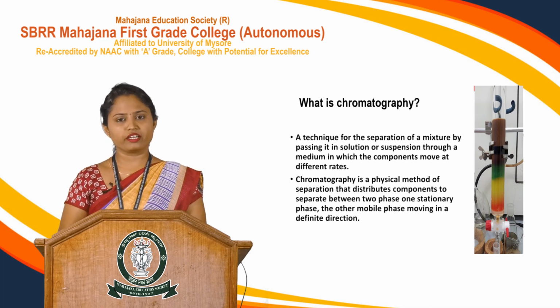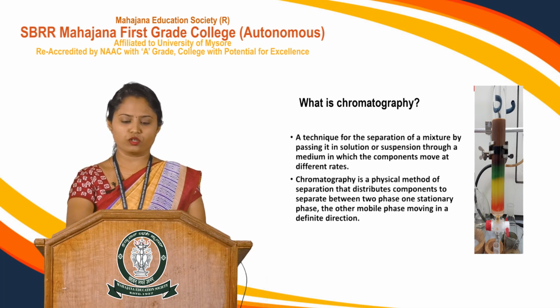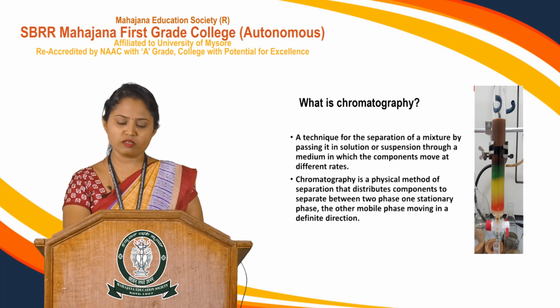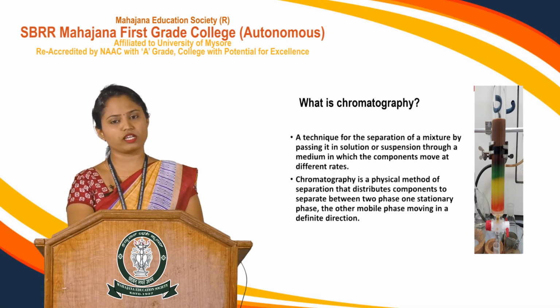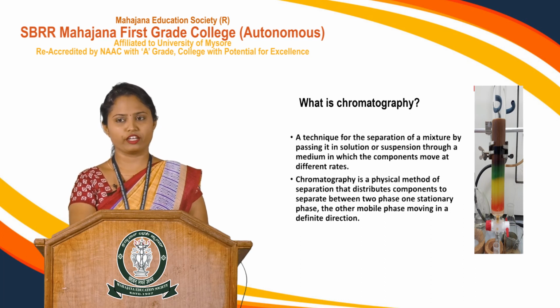Due to their migration over the stationary phase, the molecules get distributed or separated. Generally, chromatography is a physical method used for the separation and distribution of molecules over the stationary phase as well as the mobile phase, and they get separated based on different migration rates.